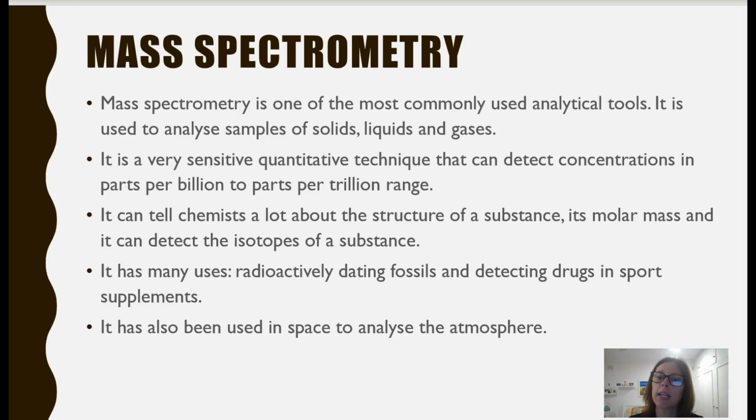And the great thing is it can tell its molar mass, which helps us work out what the structure is, and any of the isotopes that might be there as well. So it's got some great uses: detecting drugs in sporting supplements, radioactive dating of fossils, even analysing the atmosphere and what is in our atmosphere there.